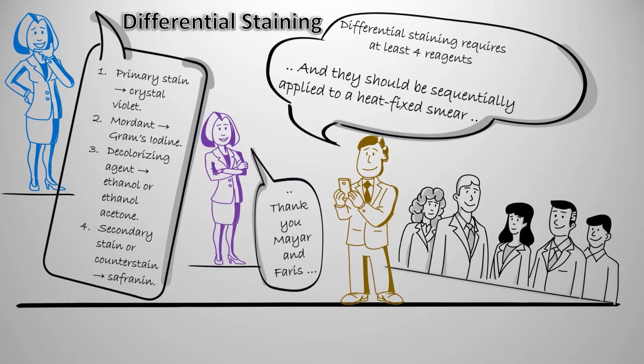This stains the bacterial cells violet or purple, and this stain is considered a basic stain or a base stain that is actually charged positive.